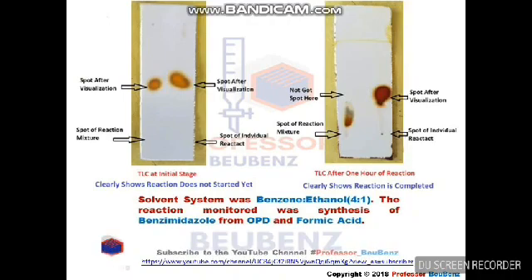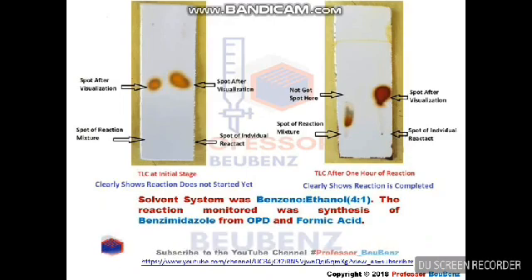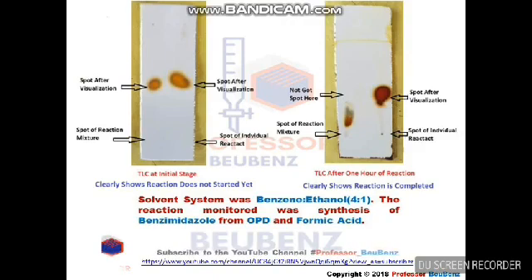Looking at the TLC after one hour of reaction, it clearly indicates that we are not getting the spot of the reactant in the reaction mixture, showing the reaction is complete. If you still get the spot of the reactant in the reaction mixture, it indicates some unreacted material remains. Additionally, tailing of the peak is observed in the reaction mixture spot, which is due to the presence of formic acid — acids typically cause tailing in TLC.